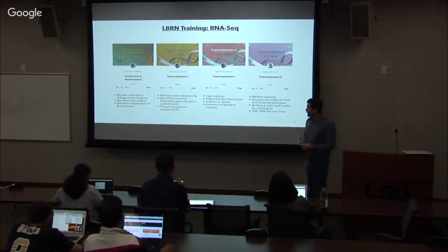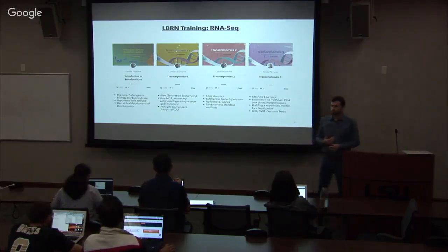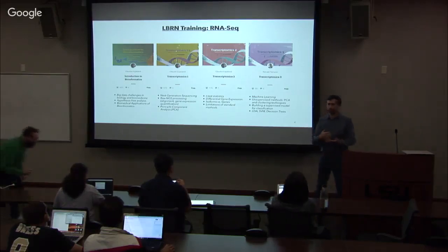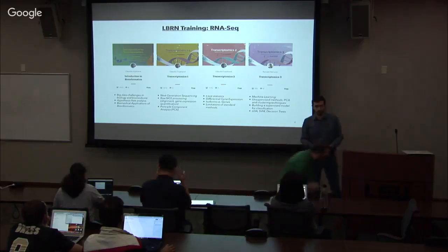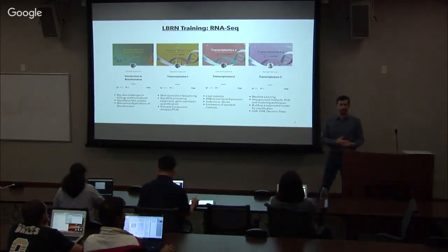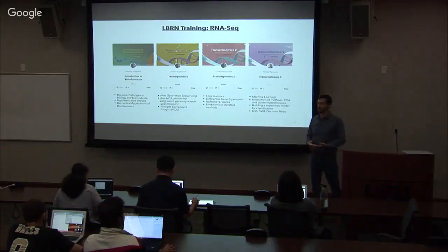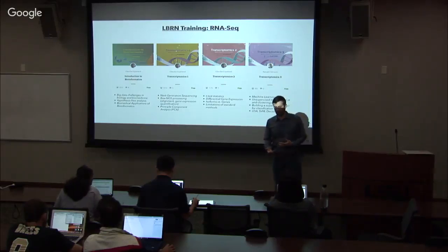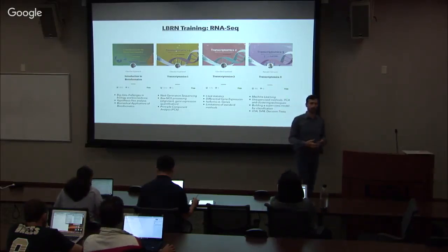Transcriptomics 1, 2, and 3 is going to walk you through processing the data from raw reads to a table of expression, hypothesis testing methods like differential gene expression or Student's t-test, and then we'll use methods like regression and classification and other machine learning methods to explore the data.